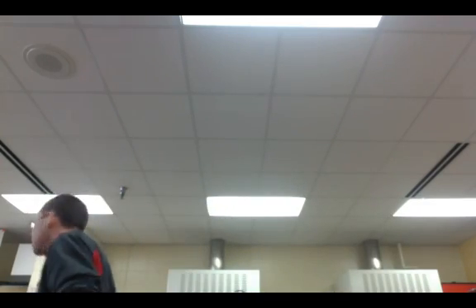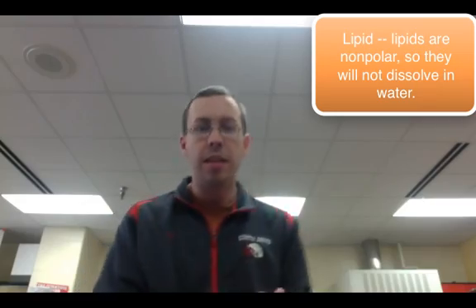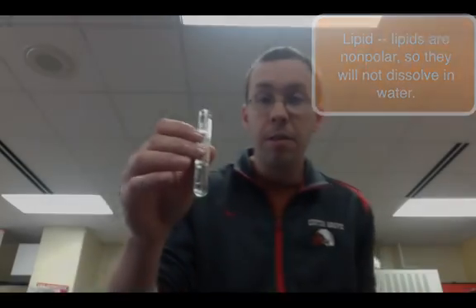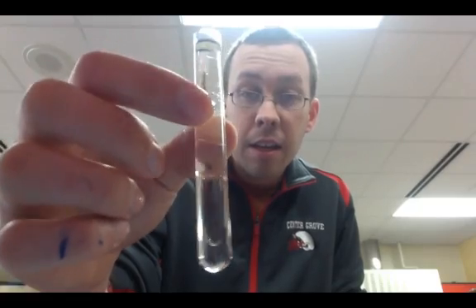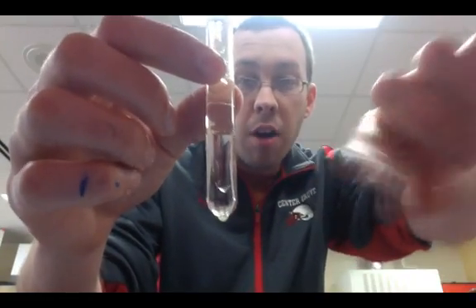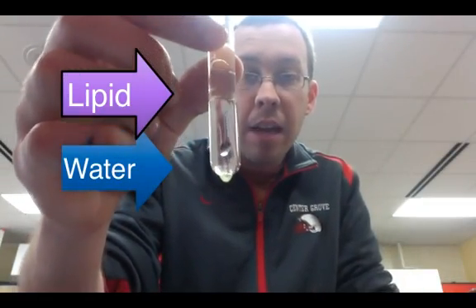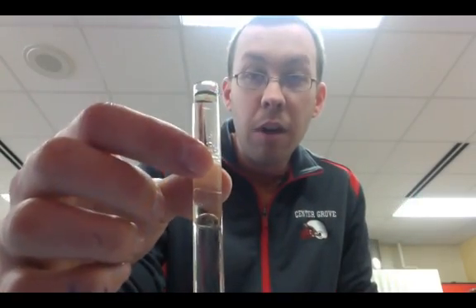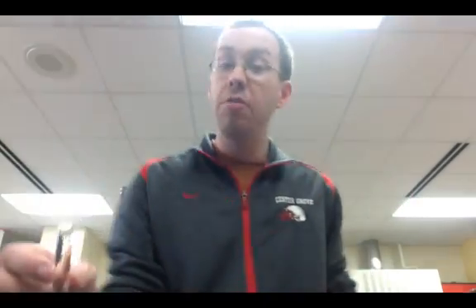The other way to test for lipids is using solubility — using the fact that oil and water don't mix. You can definitely see there's a water layer down at the bottom and an oil layer at the top. They do not mix, so that is a positive test for lipids. So those are two tests we can do — one to test for carbohydrates and two tests we use to test for lipids.